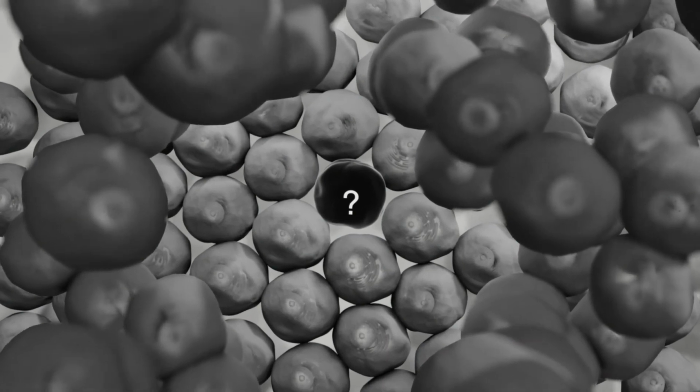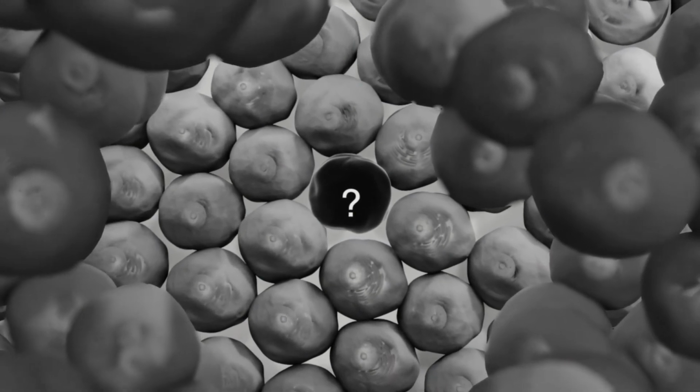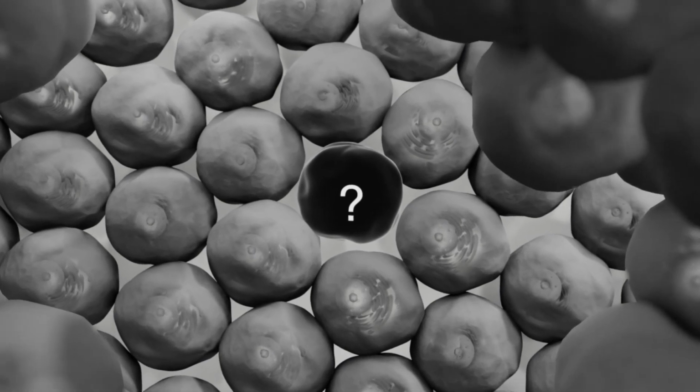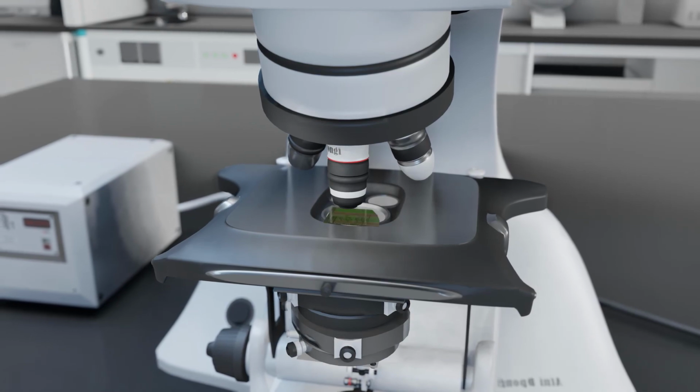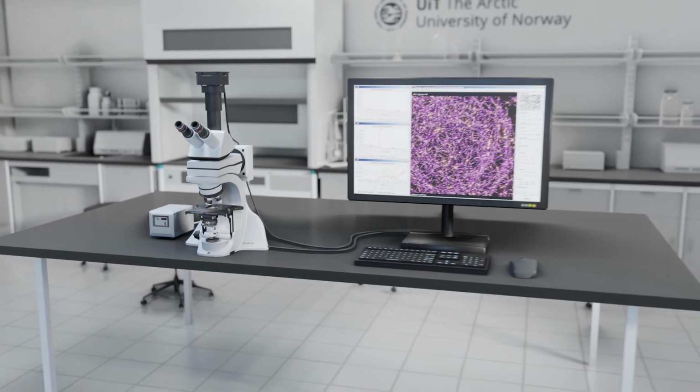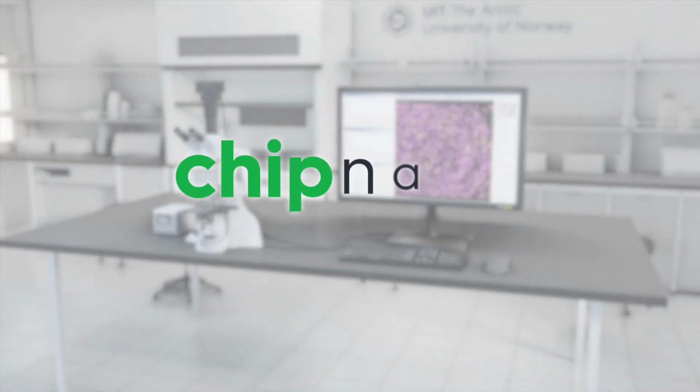The future of microscopy is bright with possibilities, and the implementation of more accessible super-resolution setups could allow for many new discoveries. Chip-based microscopy is under continuous development, and the task of commercializing it lies with the spin-off company Chip Nano Imaging.